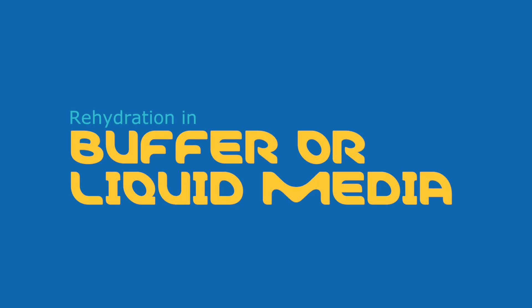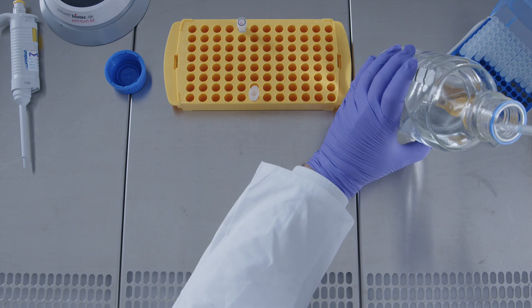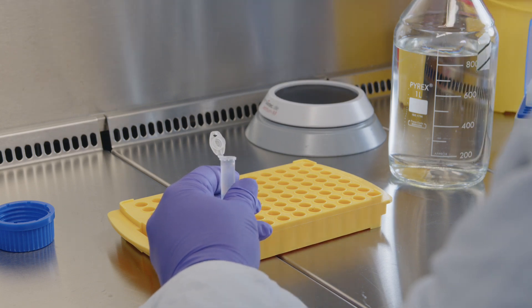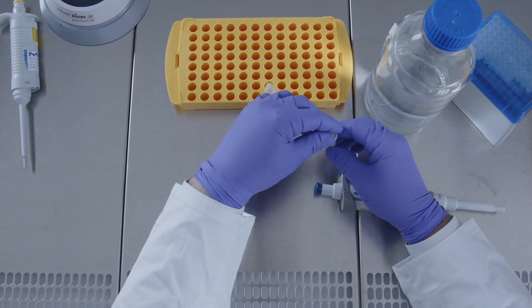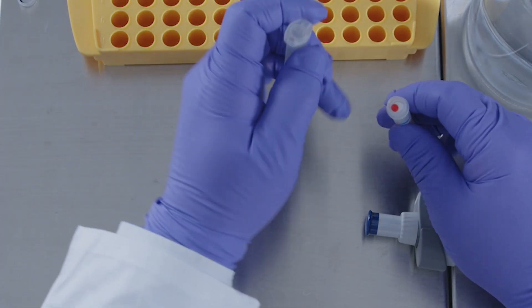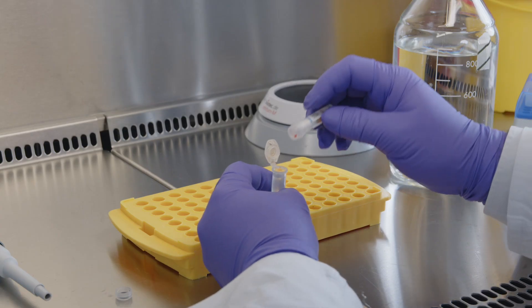If the disc has a higher concentration or is used to inoculate liquid media, the vitroids and lintocule discs can directly be rehydrated in liquid medium or buffer to finally dilute the CFU and inoculate an agar plate. Take a vial that has reached ambient temperature, open it, and drop the disc into the buffer or medium to be used.